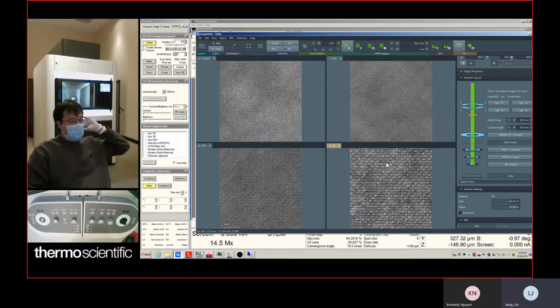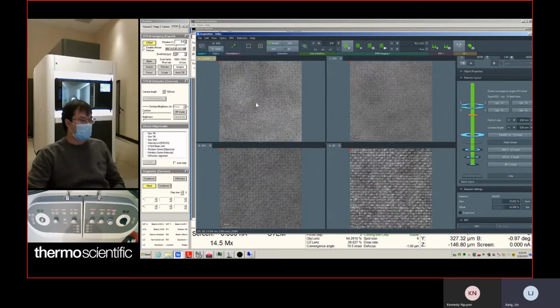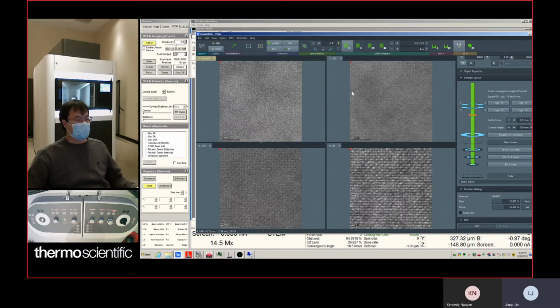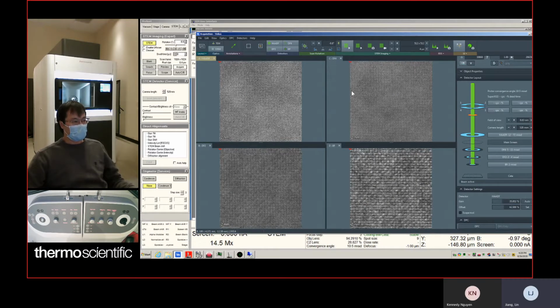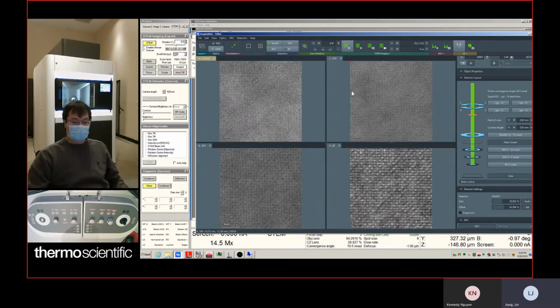Okay, so now because your camera length is pretty large, it's hard to get atomic resolution through the HAADF detector, because it's hard for your HAADF detector to receive the incoherent electrons to form the contrast imaging, right?